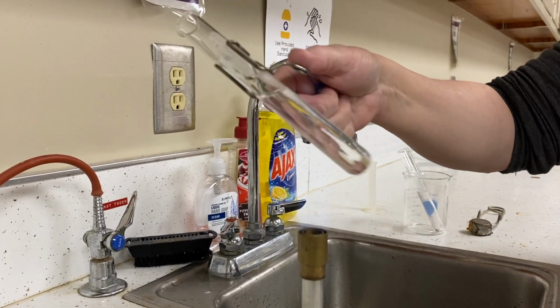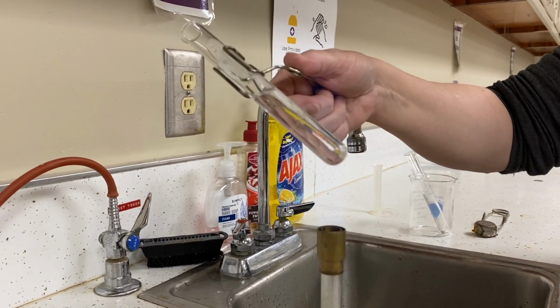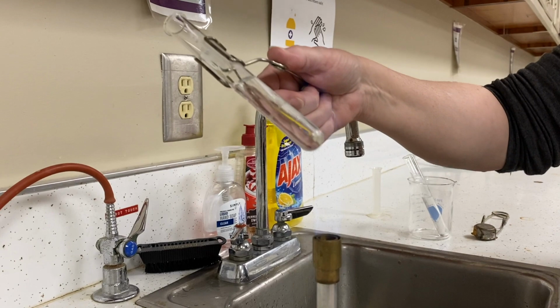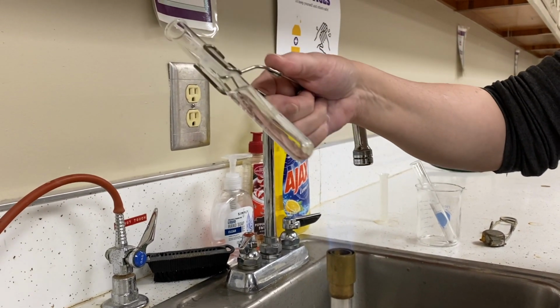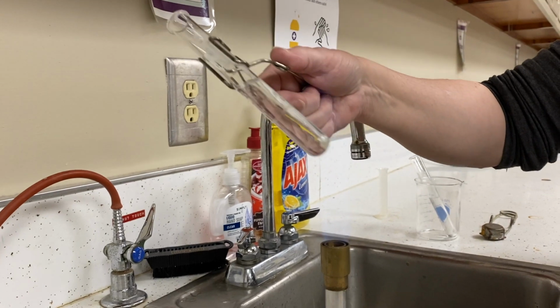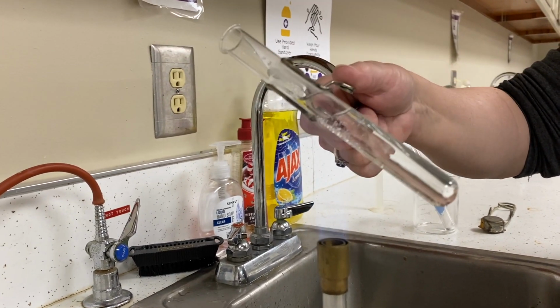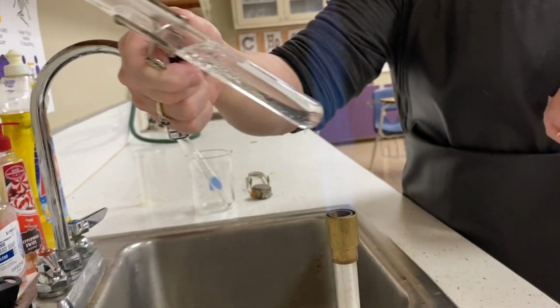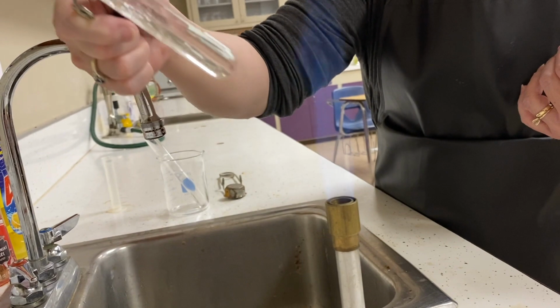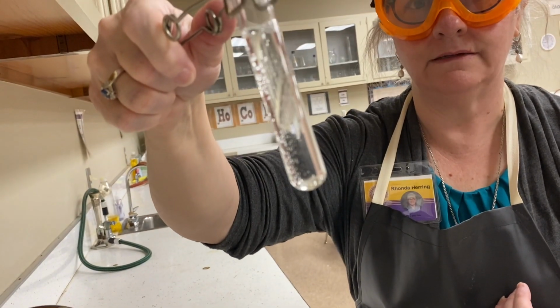Because if I leave it too long in one place, I run the risk of that area turning into the gas, right? Water changes from liquid into gas really rapidly. All right, what I'll notice is I'll have small bubbles form along the edge of that test tube, and I know that I am done with this procedure when I get that small bubble.